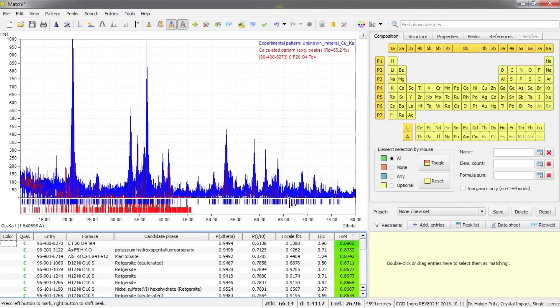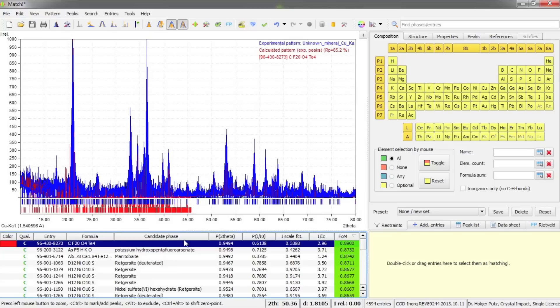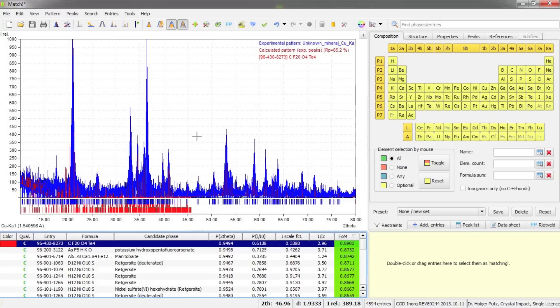The result is not very promising because there is little similarity between the best matching entry and the experimental diffraction pattern. The reason for this is that there are many peaks that have been detected because of the noisy raw diffraction data. So maybe it would be better if I could define the peaks myself.